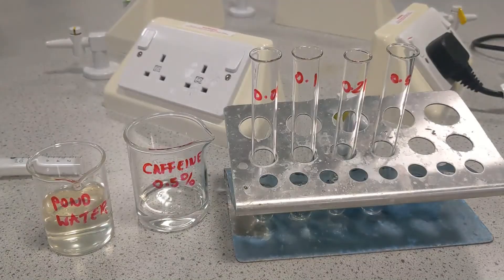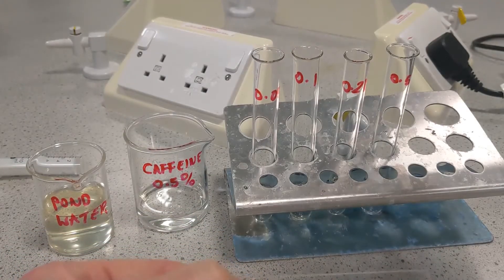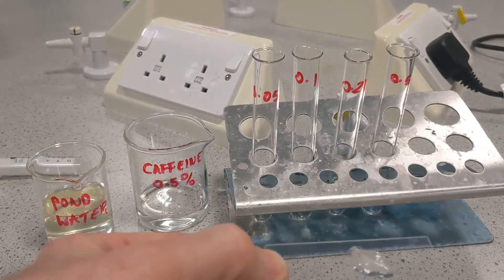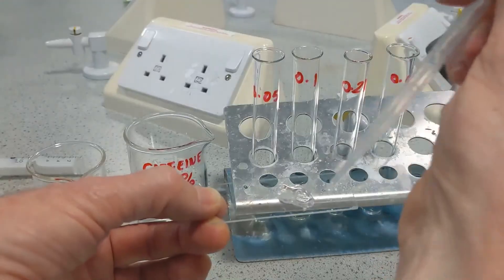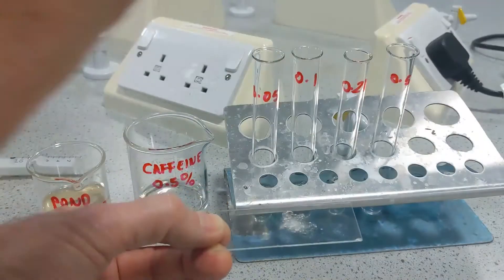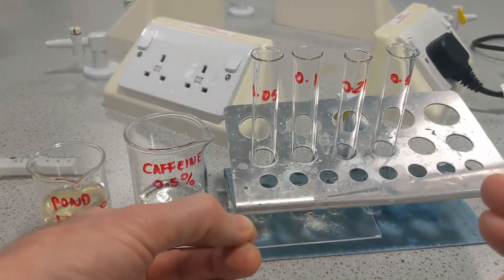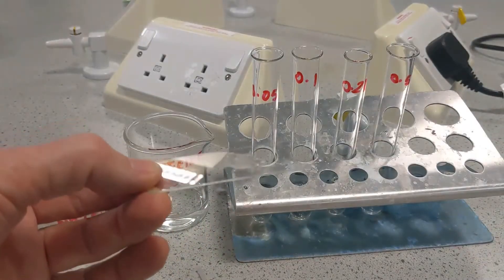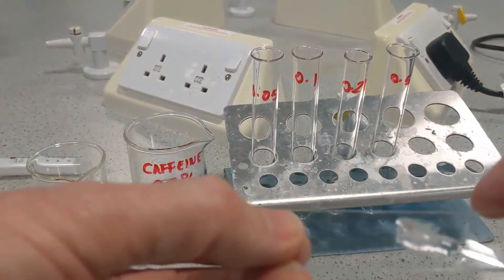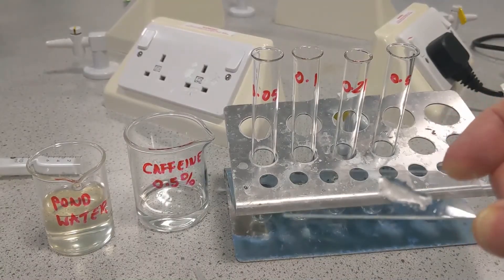Now we need to go and change our liquid on the slide for each of these. I suggest you start with the lowest concentration first — the 0.05% — and work up. To do this, it's simply a case of aspirating off the liquid from the surface of your slide and putting a couple of drops of your lowest concentration onto your slide. With your Daphnia immobilised with the cotton wool, put a couple of drops there — three drops. I suggest you leave a couple of minutes for your Daphnia to get used to the new concentration, then check on the microscope to see the new heart rate.